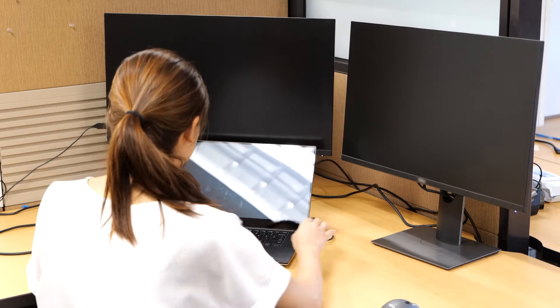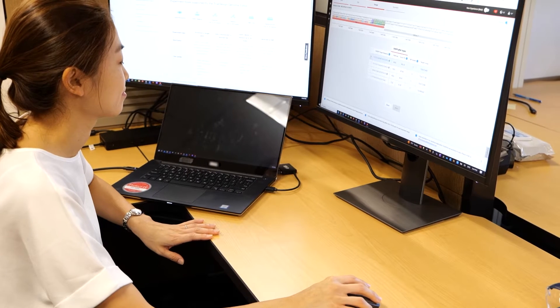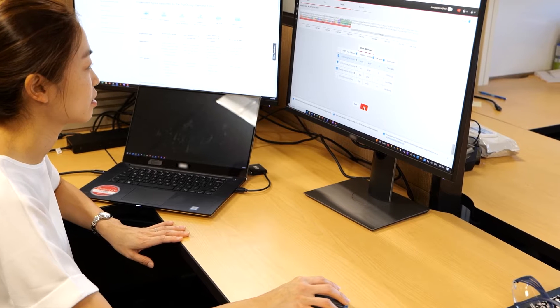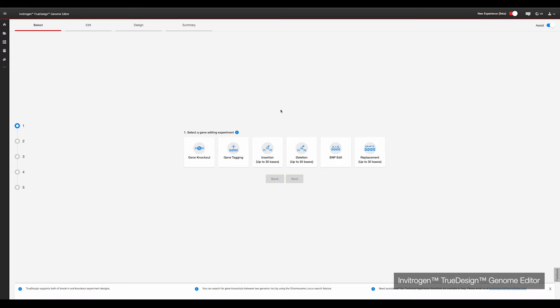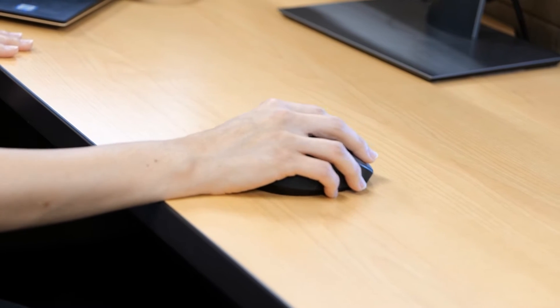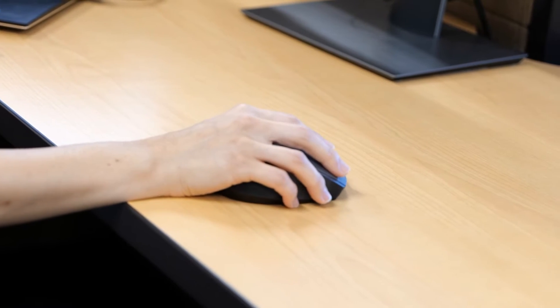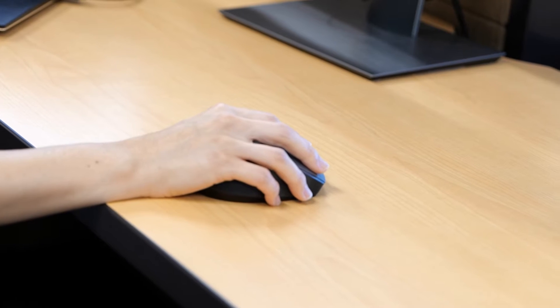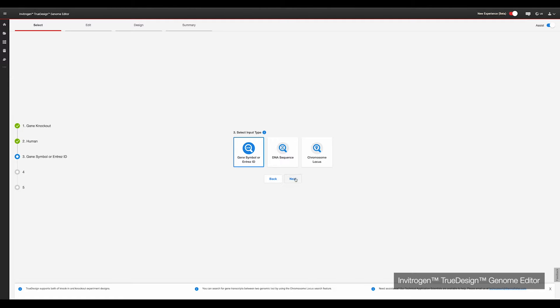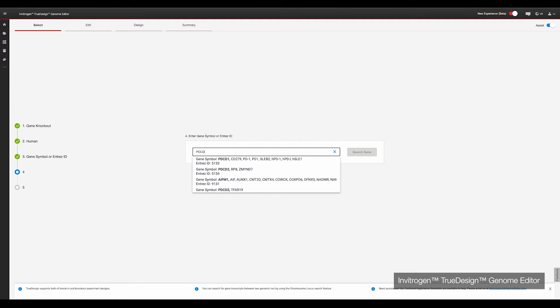The first step is to design the experiment and order the required reagents via the free Invitrogen TrueDesign Genome Editor software. For today's experiment, select Gene Knockout, select the species of cells — in this case human — and then search for the gene of interest, in this case PDCD1.